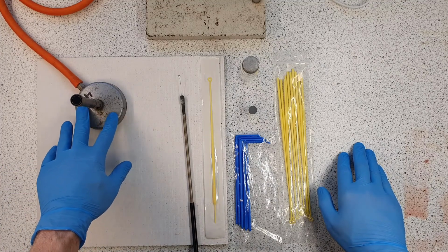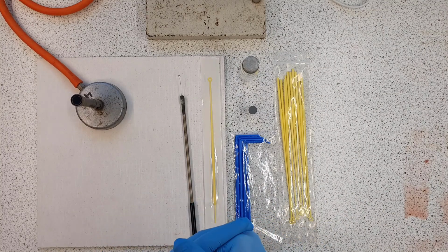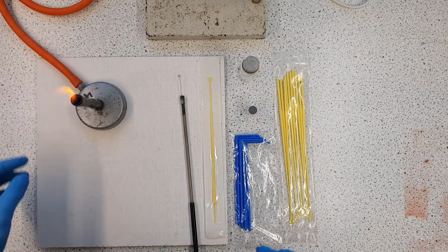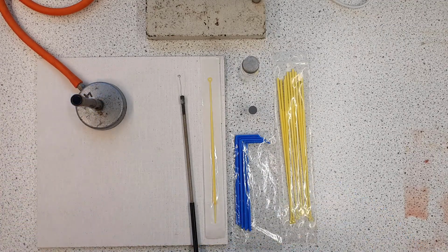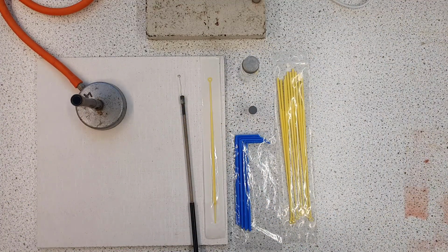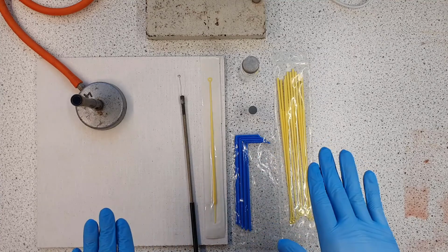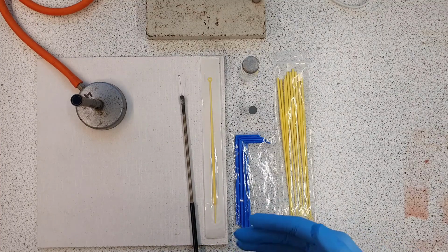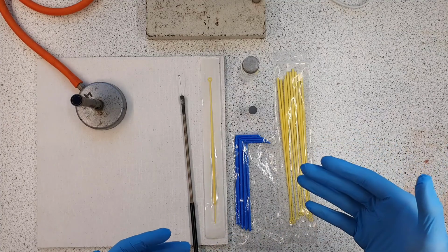And you might be wondering why we're using a Bunsen burner, because we're not necessarily setting anything on fire, at least hopefully not. But as long as it's on either a semi-blue flame or a roaring blue flame, it will create a pretty consistent convection current of heat and air, or heated air, which will balloon outwards and be sucked back in. And that will reduce the chances of any airborne bacteria or spores or particulates or contaminants from settling on our surfaces here. It won't necessarily reduce it to nothing, but in combination with other methods we're going to be using, it will certainly reduce it to an acceptable level for safety standards, and also for the reliability of our results, of course.